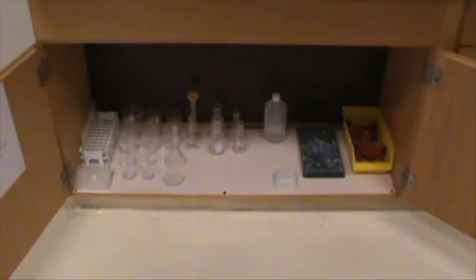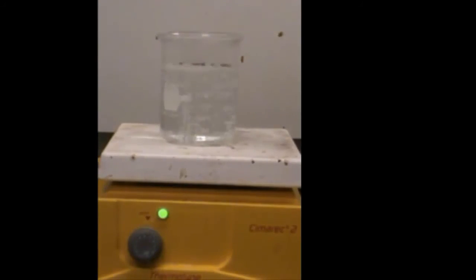You'll be heating some water in a 400 milliliter beaker. A beaker is the open, cup-like glassware. After you put some water in the beaker, add some boiling stones to the water. You can touch them. They help prevent large bubbles from forming.